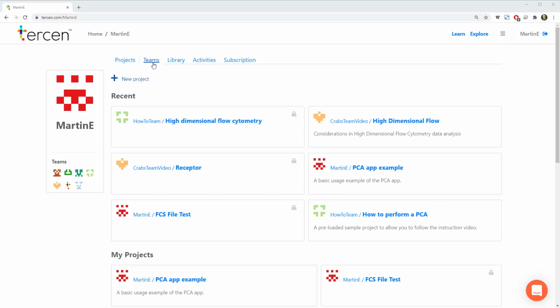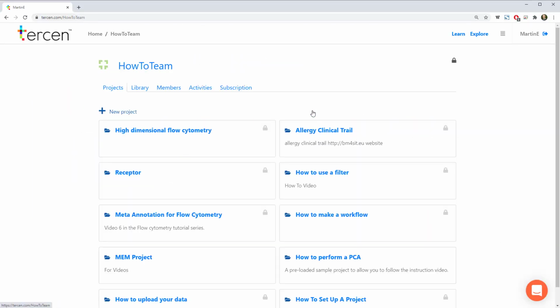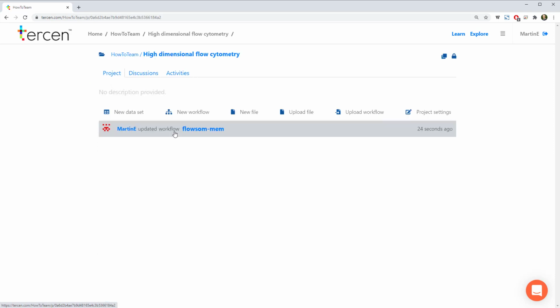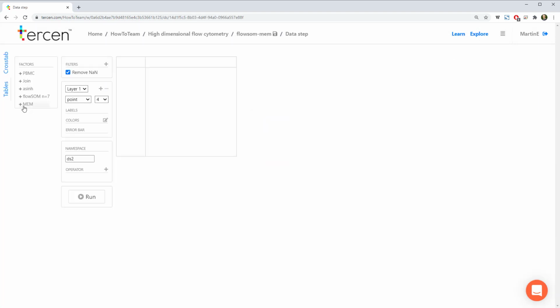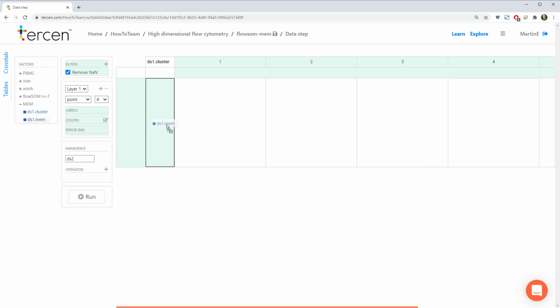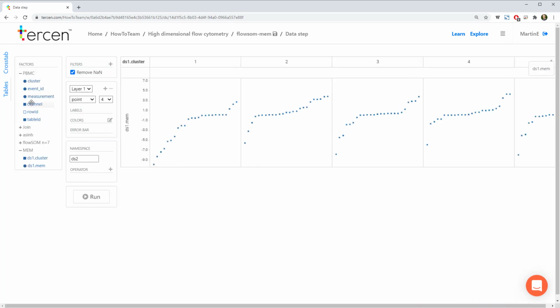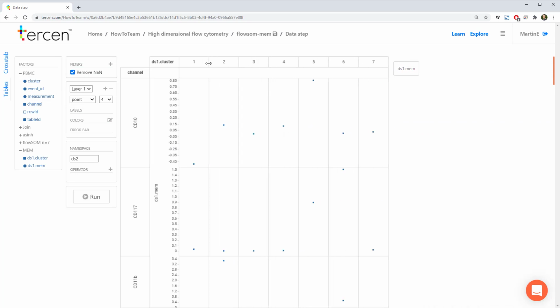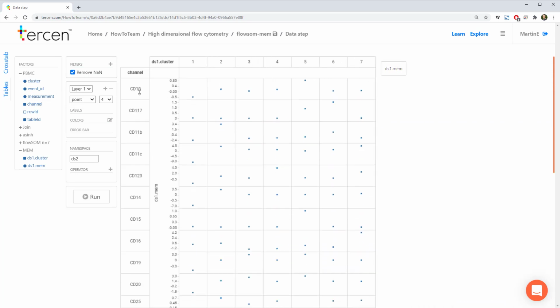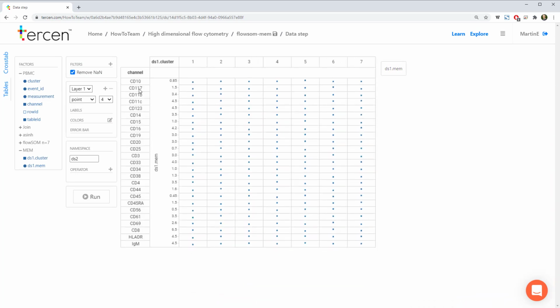Tercen solves these problems by placing a user-friendly layer over powerful statistical analysis packages such as R or Python. This allows a non-coder to build sophisticated data models by dragging and dropping elements on a screen while Tercen produces visualizations on the fly. Tercen simplifies the data wrangling and file uploading, and because it's cloud-based, it makes even worldwide collaboration so much easier. It even helps bioinformaticians optimize their effectiveness.